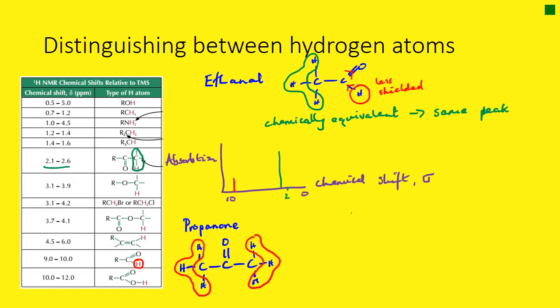So if we did our spectrum there, I'll just say ab for absorption, and of course most of the chemical shifts or the frequencies are going to be 0, but we are going to have 1 peak this time, like we've said, and let's find that on the table. That is going to be this one here. So let me do that in red rather.